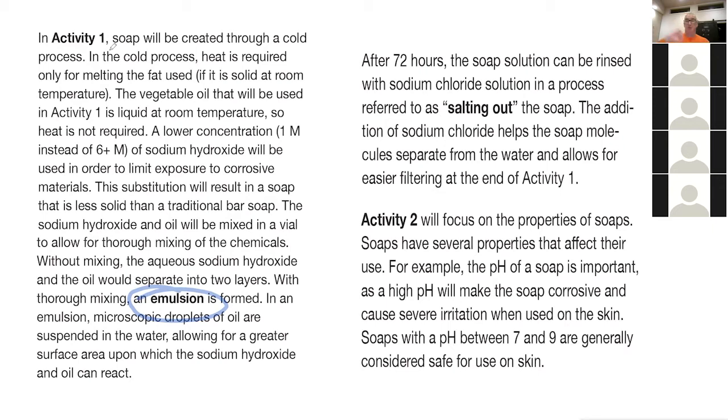But if you break up the droplets of oil until they're super small, then they will stay suspended in the water for a little while. You'll probably notice they start moving back together, forming larger and larger droplets, until eventually they separate completely. So tonight we're just going to add them together and then probably shake them two or three times.